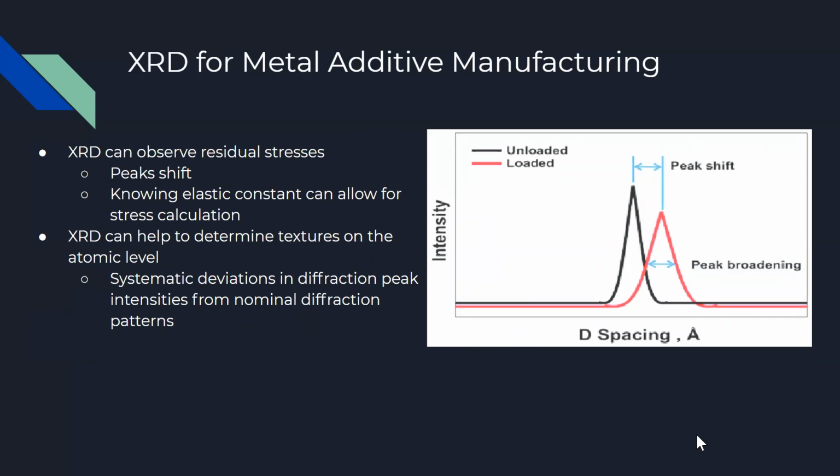Residual stresses are not desirable happenings in samples either, which is why X-ray diffraction is used to identify them. When an X-ray diffraction pattern is assessed, peak shifts can indicate a change in the crystal lattice parameter or crystal size in general. This could potentially imply an impurity in the substance or faults and dislocations.